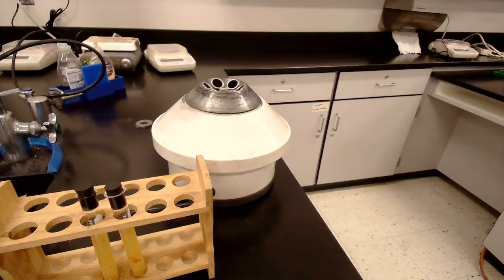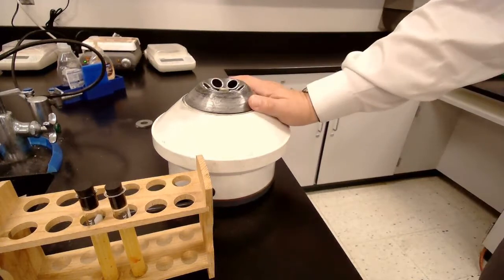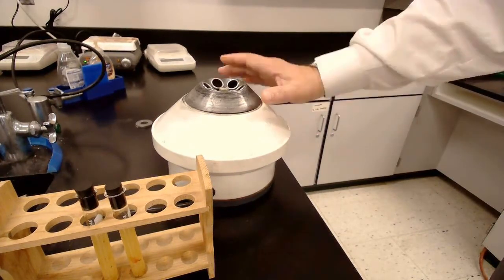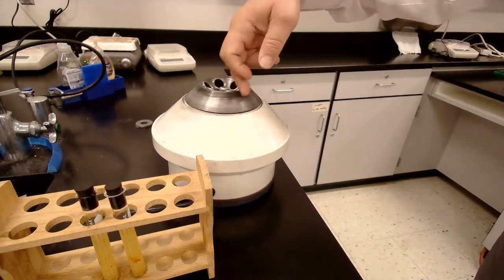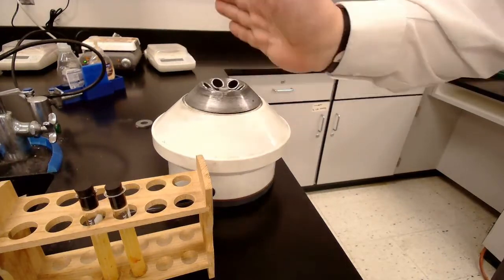So, this is station 5 where we're using a centrifuge. The job of a centrifuge is to spin, and as it spins, it pushes objects further and further away.